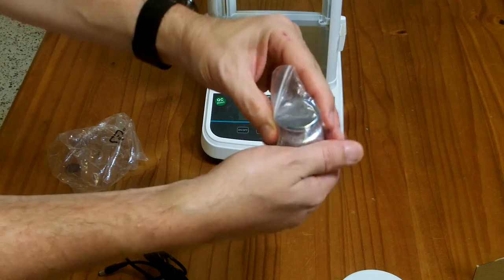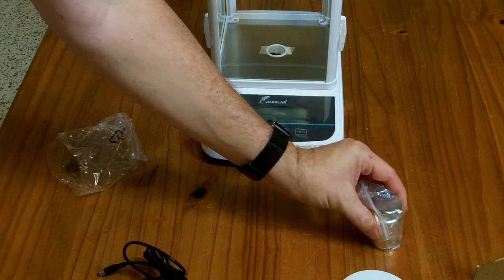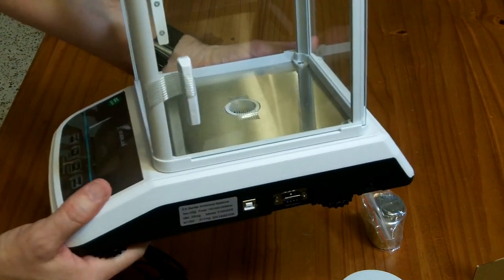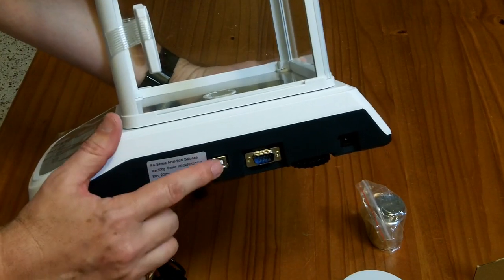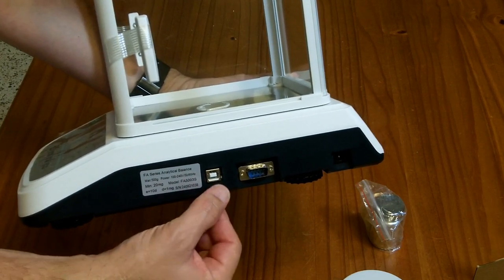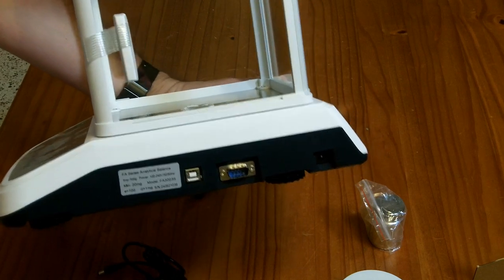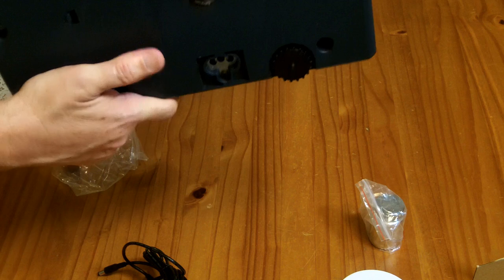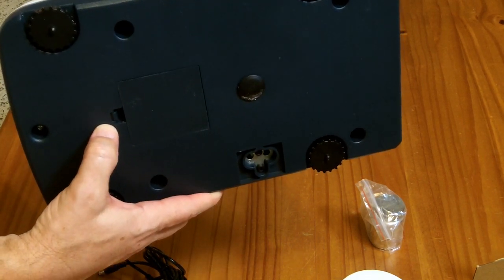So this calibration weight says M1 and it has a 500G on it. Now the scale on the side here has an RS232 interface. There's also a USB port and this is the older USB style B connector, the old style square printer port cables. And that's the power supply in. There is also on the bottom a battery compartment so you can run this scale off of four AA batteries if you'd like.